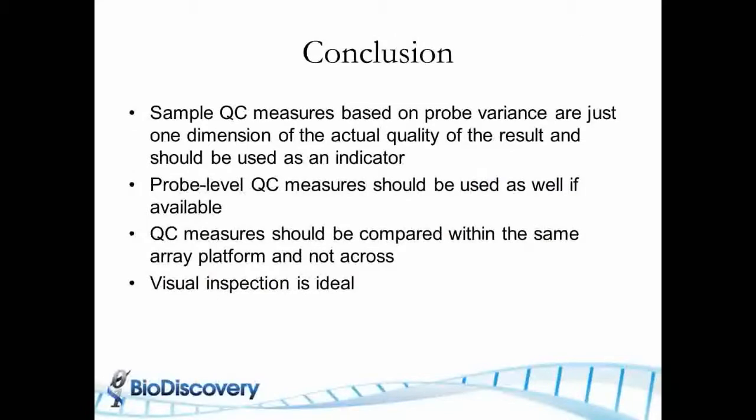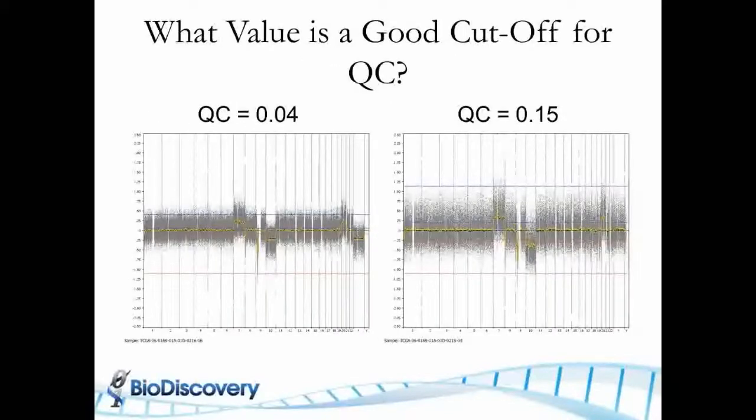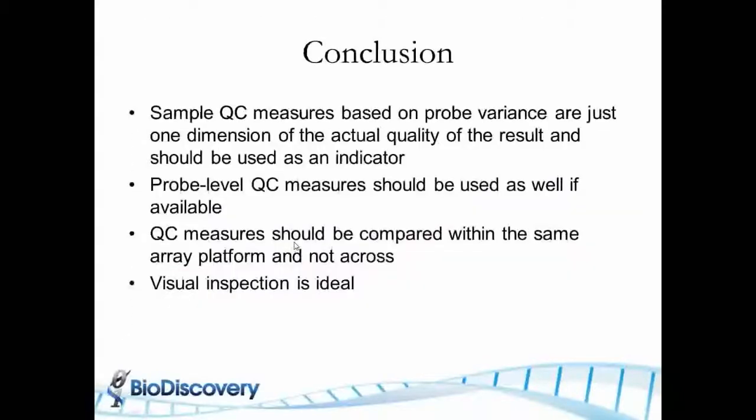So the conclusion here, before one additional comment I want to make on this, is that just measuring how much variation you have is only one aspect, because in a sense, if you have a very flat line here, that could be because it was a bad hybridization and you really have no signal, even though there were some changes there.